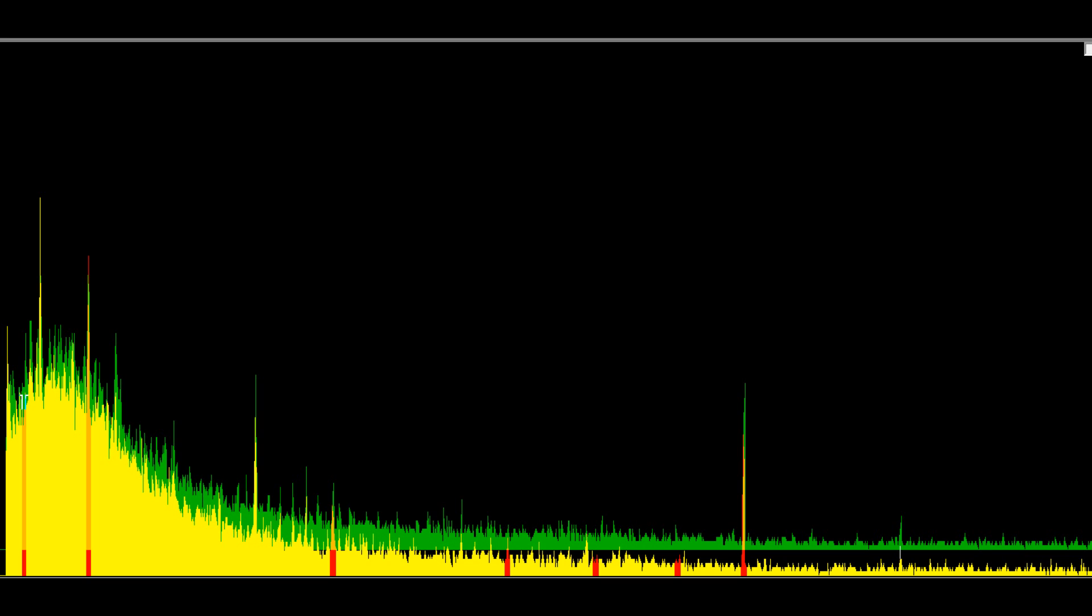So this is the spectrum of that balloon I had put outside in the afternoon that was quite radioactive, about three times background radiation.